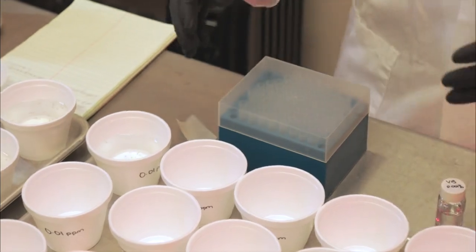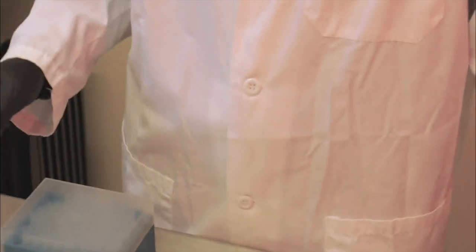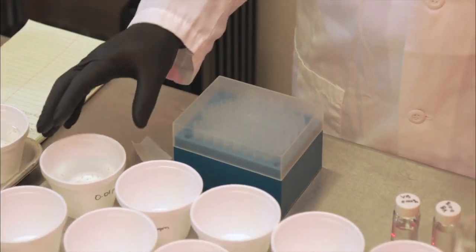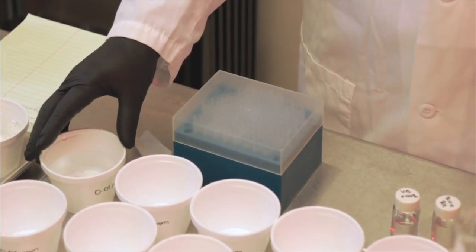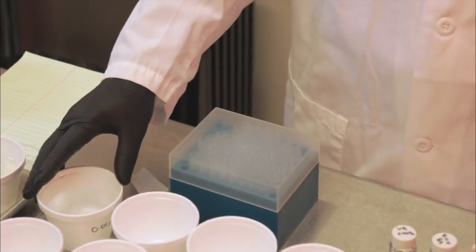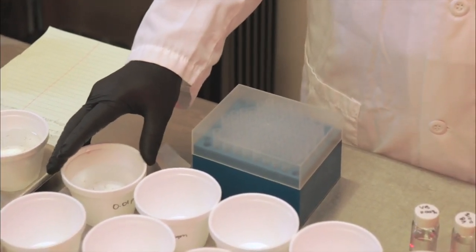And after this, you keep this setup at 82, I would say 82 to 85 degrees, kind of warm, because mosquito larvae feeding behavior is controlled by water temperature. You keep this setup under this temperature for 24 hours. Then you read your results. We're going to talk about how to read them just a little bit.